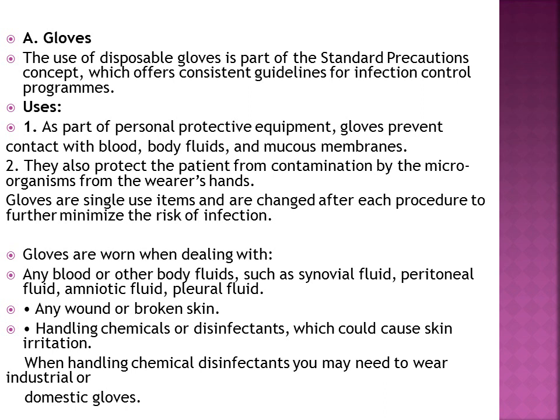So a separate pair of gloves is used for each separate procedure or each separate patient, and for the same patient, if the gloves are soiled, then you have to change the pair of gloves. Gloves are worn when dealing with blood or body fluids such as synovial fluid, peritoneal fluid, amniotic fluid, pleural fluid, any wound or broken skin, and when handling chemicals or disinfectants. While handling chemicals and disinfectants, we can use domestic or industrial gloves.